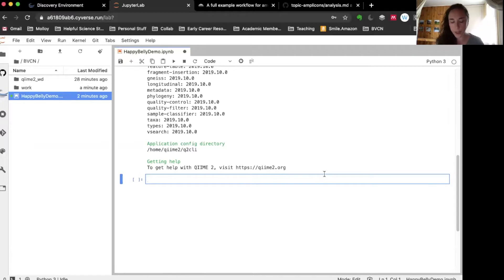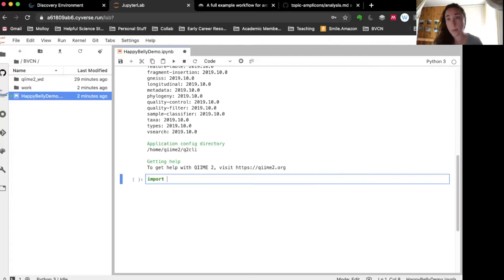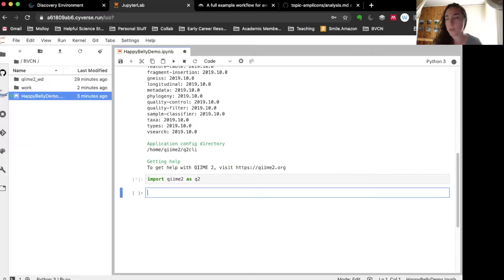Another thing I want to do is import the Python tool that lets us embed QIIME 2 visualizations into this Jupyter notebook. If you're following along in a local installation you won't necessarily be able to use this, but this is another benefit of using QIIME 2 tools within CyVerse because they have the installation for QIIME 2 and this neat tool that lets us put interactive plots within our Jupyter notebook as we're analyzing the data. It's called QIIME 2 and I'm giving it a nickname 'q2'.